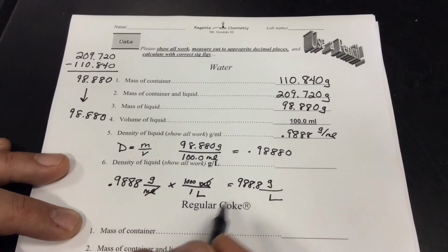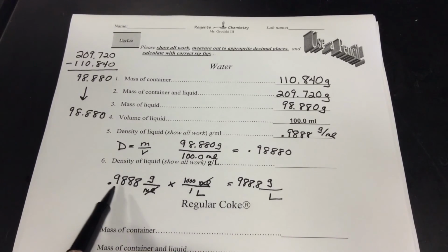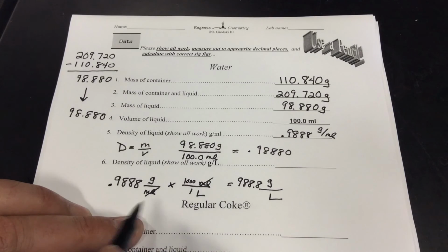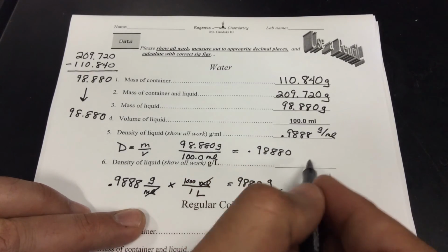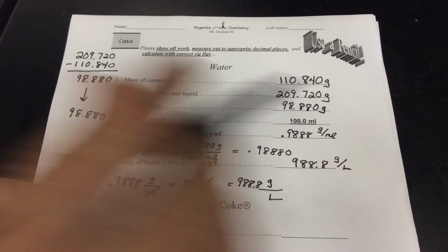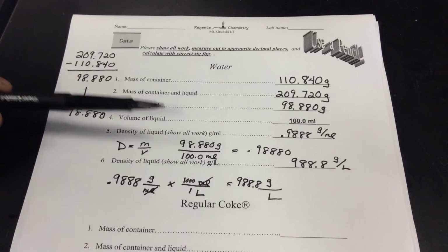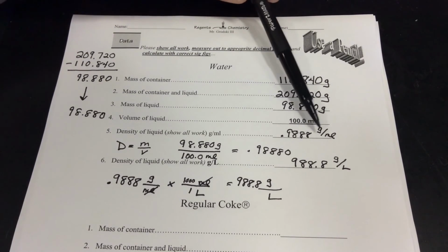988.8 grams per liter. And you say, well, how do you know how many sig figs? Well, remember, in a conversion, if you start with 4, you should end with 4, because these are not measured values. Everything's coming back together with this nice lab. These labs take into account everything you've learned here. So we want to put our value in as 988.8 grams per liter. And now you understand, and it's pretty intuitive, I think, grams per milliliter. Well, a milliliter is tiny, so it's not going to be many grams per milliliter.